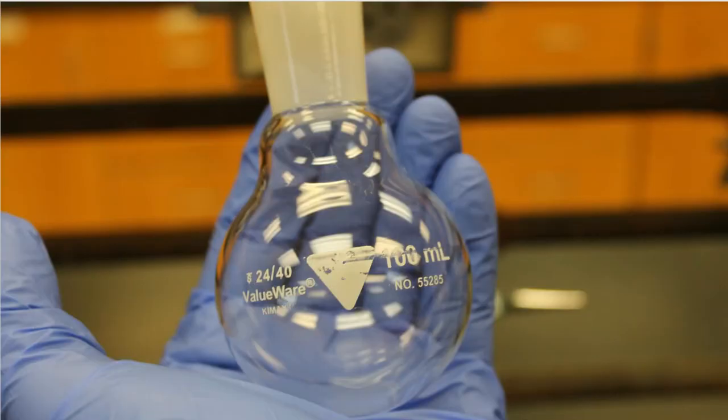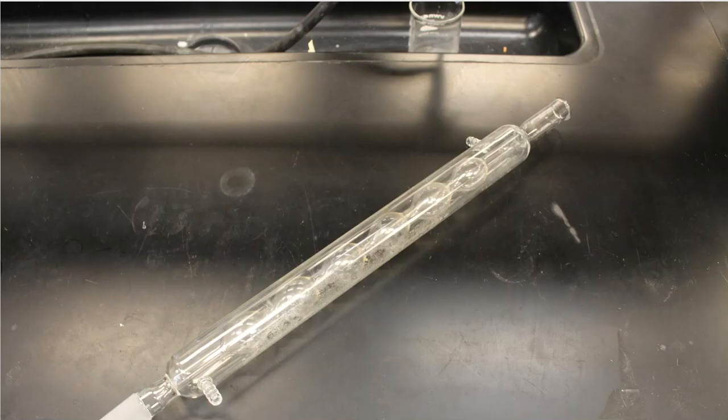Well, first, I need a boiling flask. So a 100-mL boiling flask was pulled from our cabinet. I also need an Allihn condenser or a simple reflux condenser. So this is going to get heated. It's going to maybe release some vapor, and the condenser's purpose is to condense that vapor back down into the boiling flask so I do not lose anything over time.